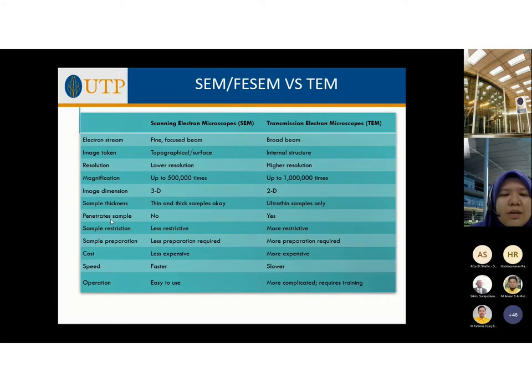So for penetration, like previously mentioned, for TEM it penetrates through the sample, and in terms of sample restriction, of course TEM is more restrictive. So you can't really analyze all of your specimens using TEM, especially if let's say you have solid metal. So we need to undergo a very stringent sample preparation procedure.